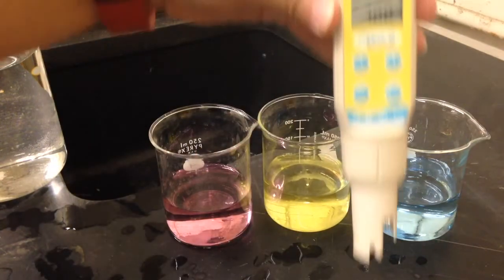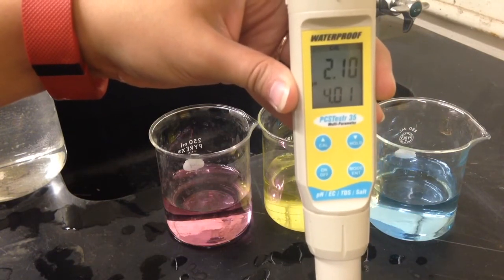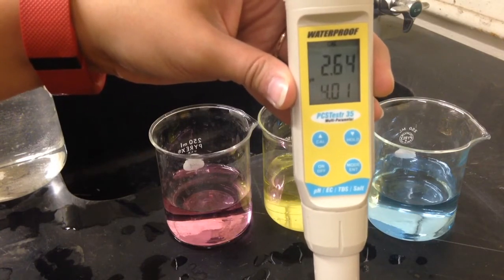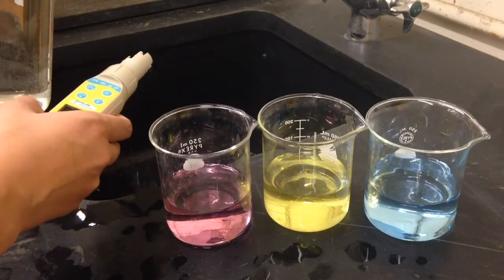The primary display will flash, and the secondary display will show the other calibration standards in which we can calibrate our meter. Before we can use either of those standards, we need to rinse our meter. So I am going to rinse my meter three times with the tap water.